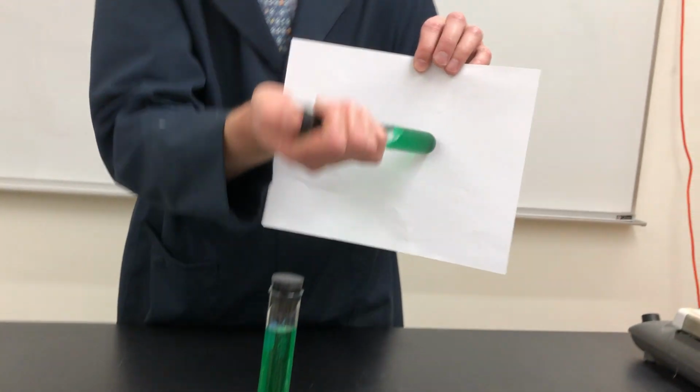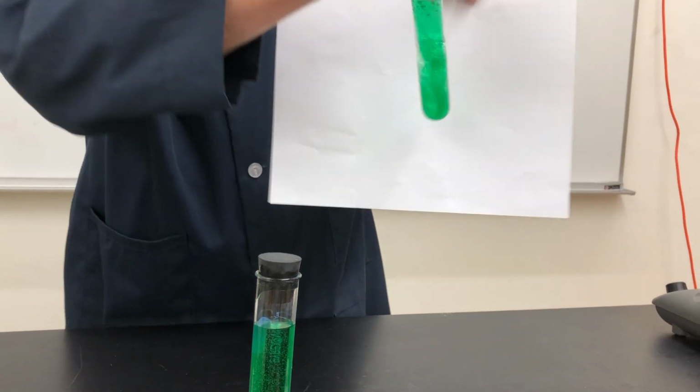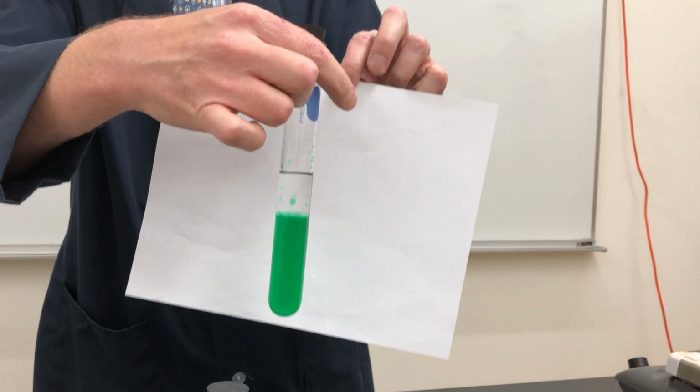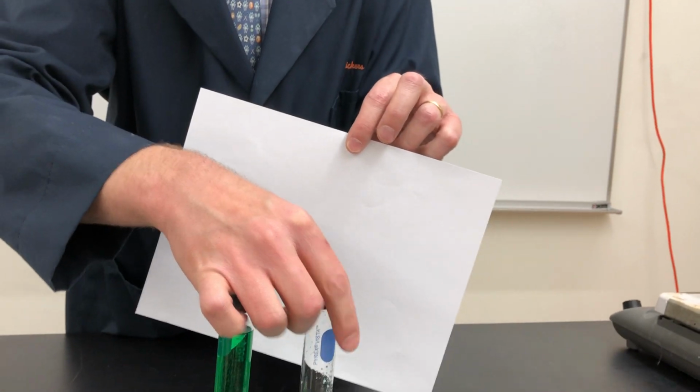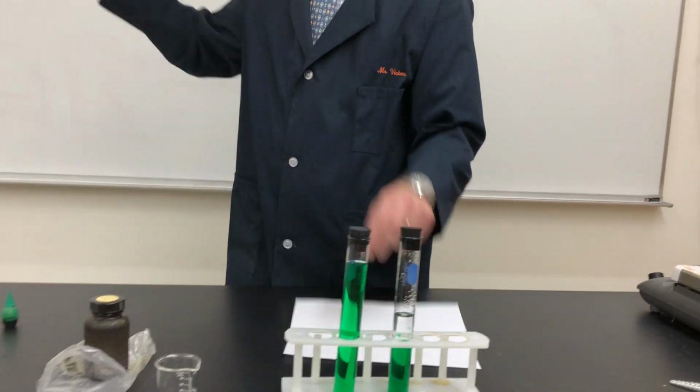I try that with the hexane, turn it over, hexane goes to the top. Turn it back over, hexane goes to the top, doesn't mix with the water, doesn't take on any of the food coloring. Okay, so why is that? Well, it all has to do with intermolecular attractions. Let's come over here.